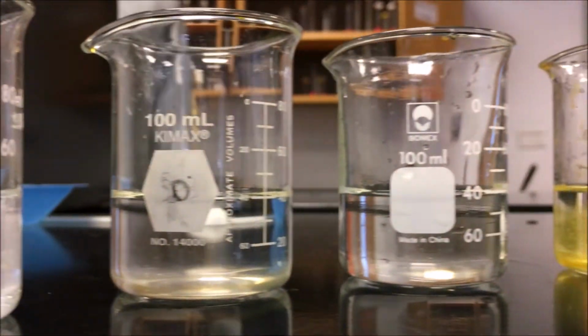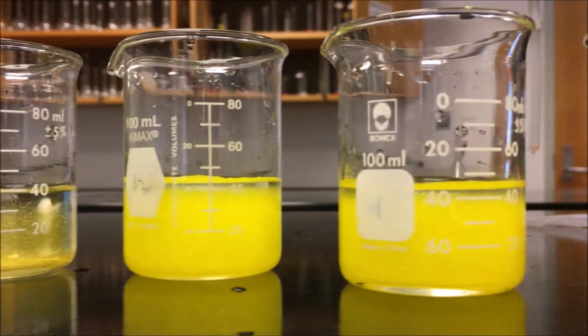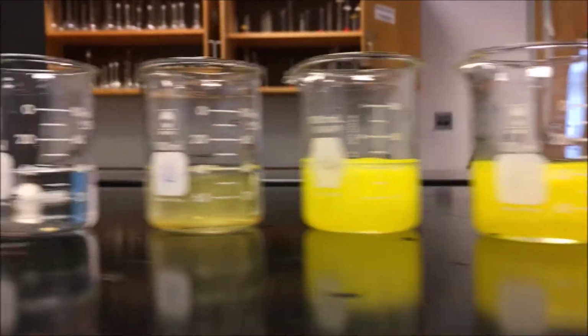By lining up our beakers 1 through 7, we can tell that the fourth beaker is the closest to Ksp. It precipitates the least out of the last 4 beakers.